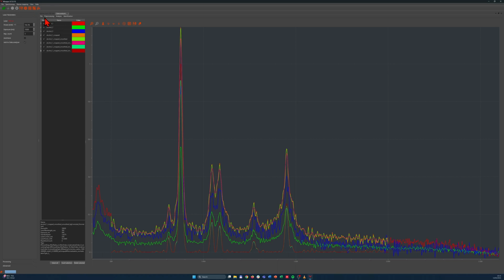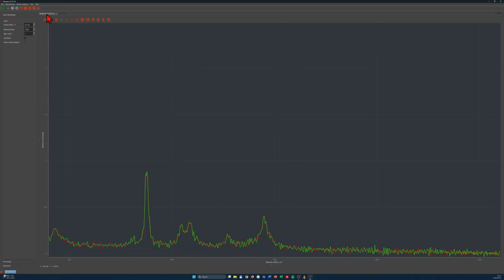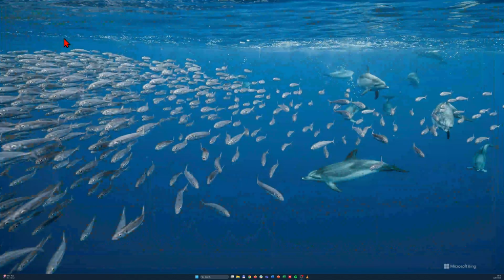So that's more or less everything what I wanted to show to you today. You can exit the software by clicking on the cross over here, as you know, or just do File, Exit. So now we quit the software, and thank you for your attention.